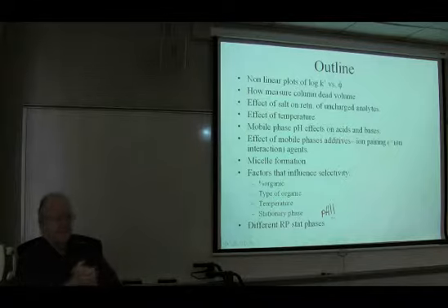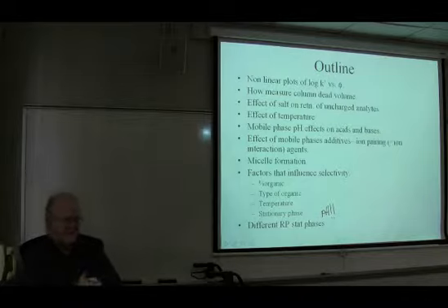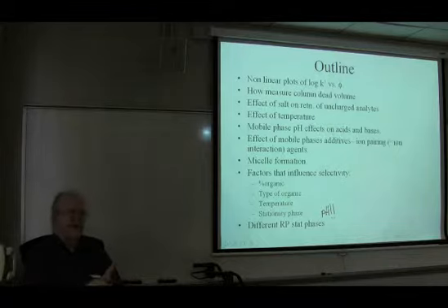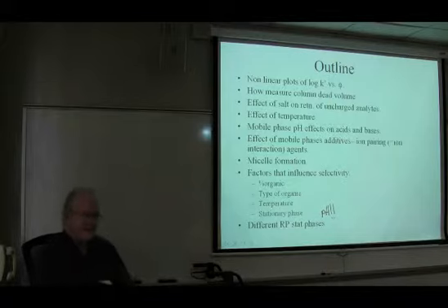So viscosity is another issue. Some solvents form very high viscosities with water. Ethylene glycol, for instance, would be a great co-solvent for water in reverse phase, but the viscosity would kill you. You just couldn't deal with it. DMSO, very interesting material, but the viscosity will just kill you. So methanol, acetonitrile, and THF are used 99.9% of the time. There are differences in selectivity as you go from one solvent to another. We'll talk a little bit more about that today.